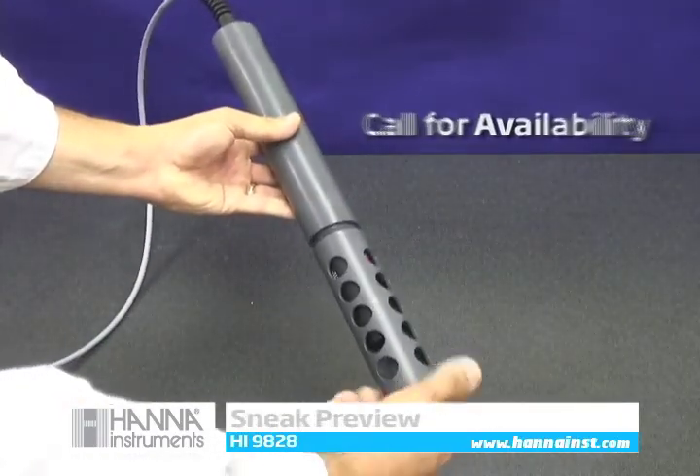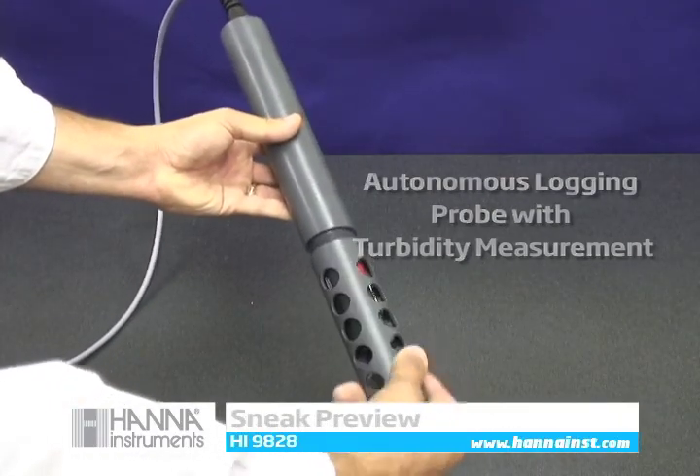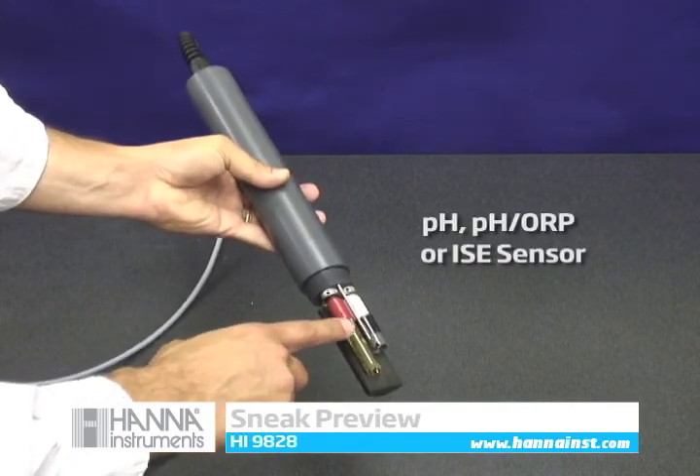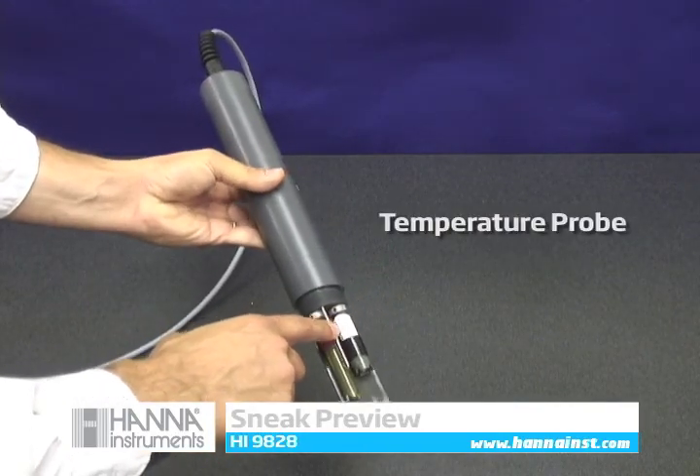Call for availability on our autonomous logging probe with turbidity measurement and ISE sensor compatibility. With autonomous logging, there is no need for the probe to be attached to the meter when logging samples.